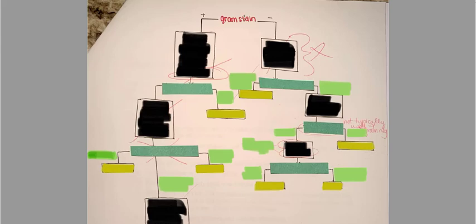And what I mean by that is I have blacked the rest of this out so that you do the work on your own. But here, we know that this list here were all of the organisms that this person thought were gram negative, or should have shown up gram negative. And then this arrow down is going to go to the next test that they would have done on those organisms to try to separate them out further.